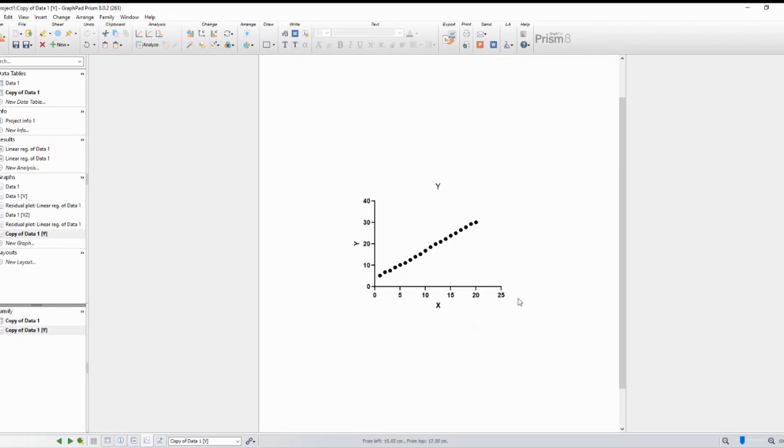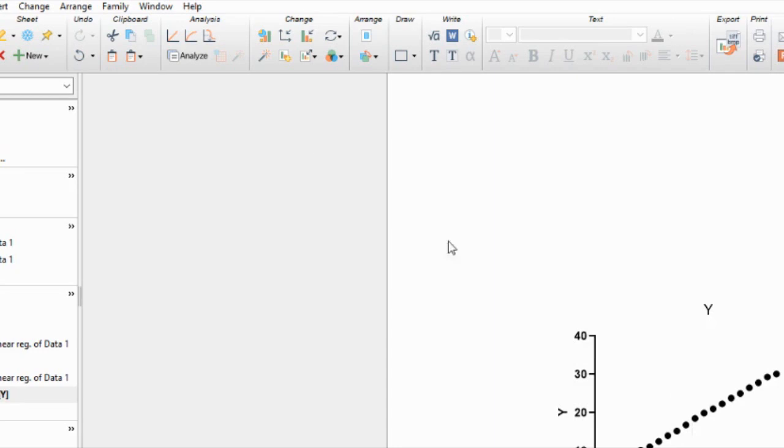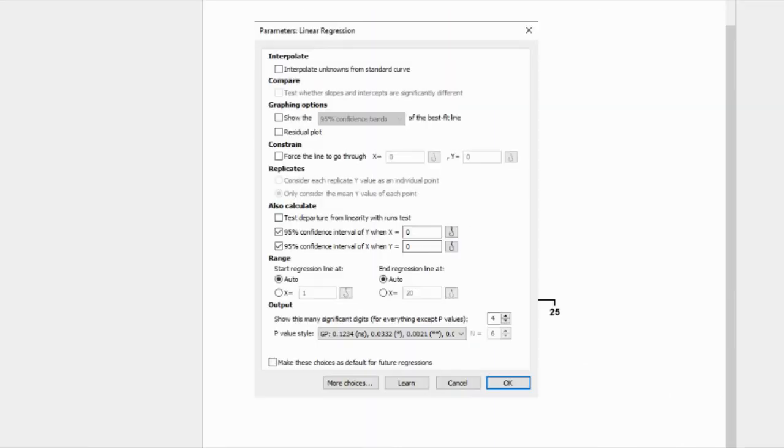To check for homoscedasticity, we need to add a trend line to the scatter plot. Click on any data point in the plot to select the dataset, and then go to the Fit Linear Regression menu and check the Residuals box.